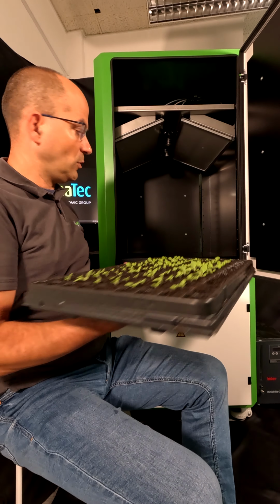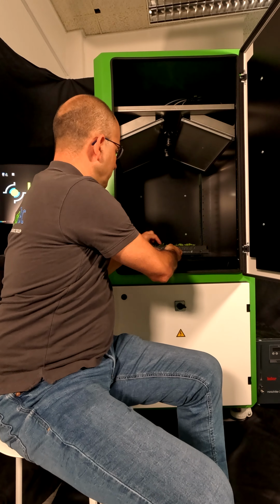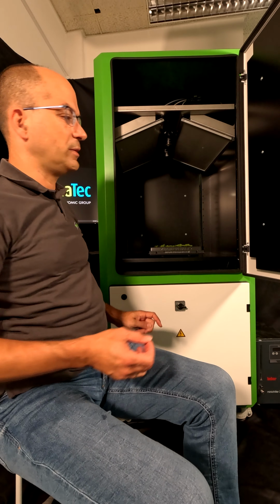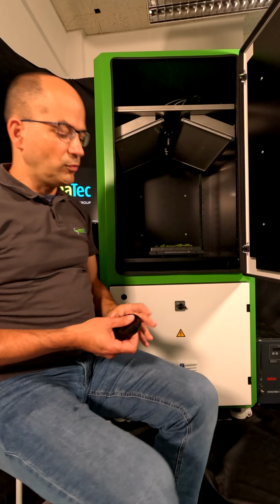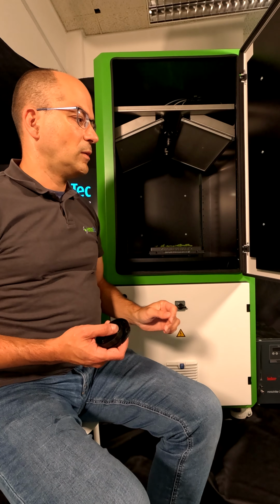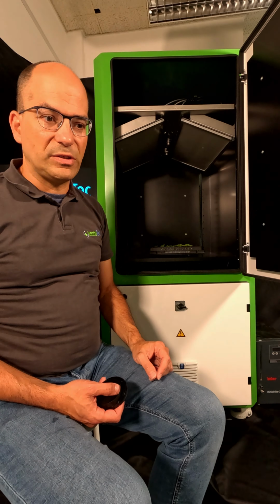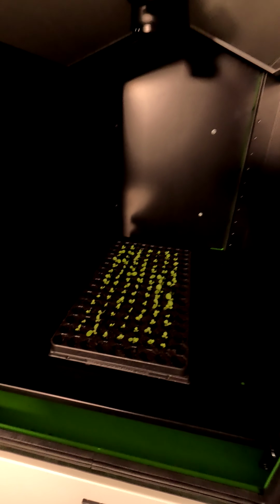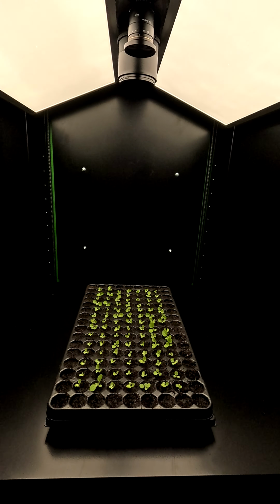And when the cabinet is open, we can insert the sample tray. So now the sample tray is on the sample stage below the cameras, and after removing the protective caps, we can access the cameras in the software to record images. Having placed the sample inside the imaging cabinet, the plants are now located below the cameras and the lamps that are required for RGB imaging.